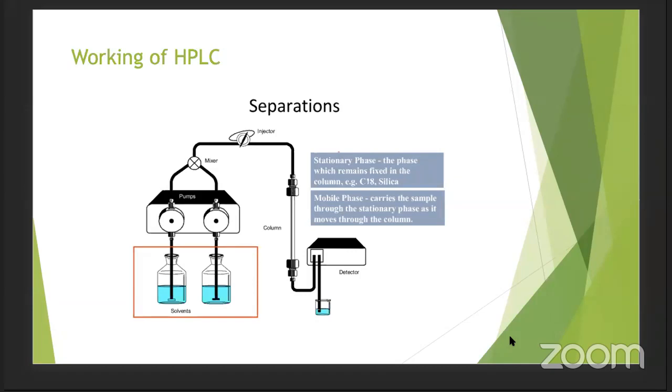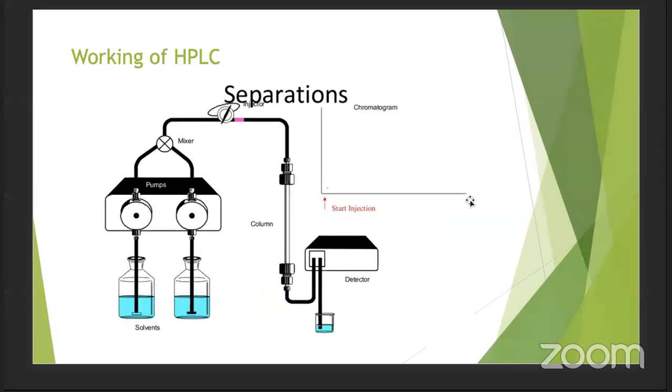So this is the schematic, or rather the working of the instrument. So this is the instrument, how it looks. So now what I will do is I will inject a sample. So here I injected this pink color sample, which has multiple components.